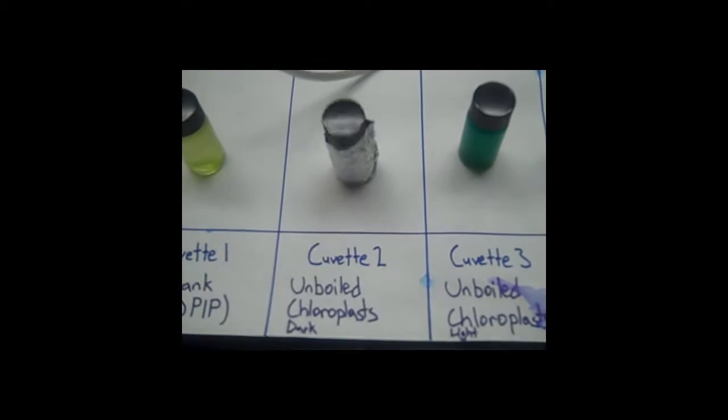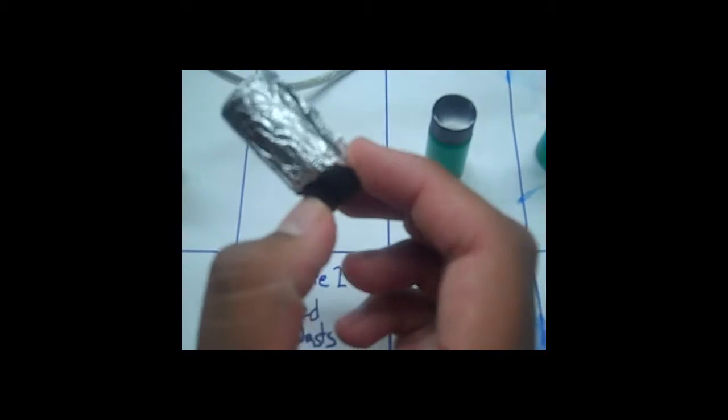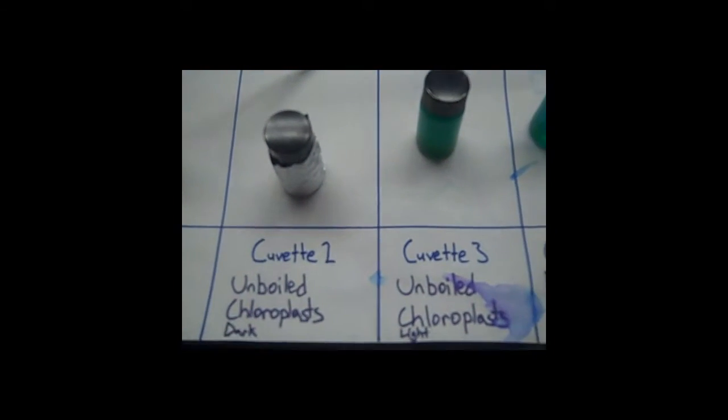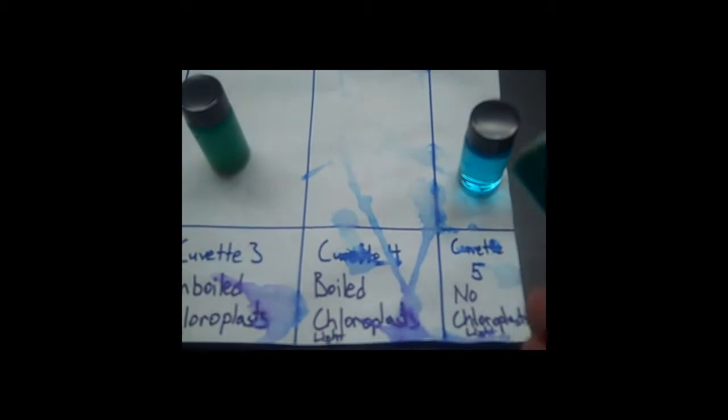Cuvette 2 contains unboiled chloroplast and buffer and is enwrapped in foil to represent the dark reaction. Cuvette 3 contains unboiled chloroplast and buffer and DPIP to represent the light reaction. Cuvette 4 contains boiled chloroplast and buffer and DPIP and represents the light reaction. Cuvette 5 has no chloroplast and only DPIP and buffer and does the light reaction.